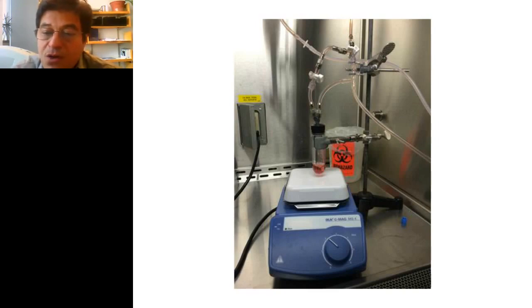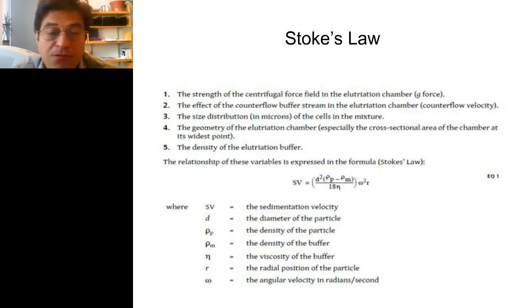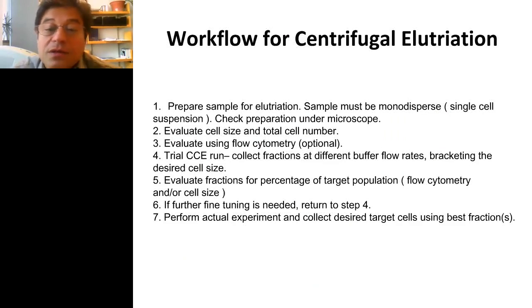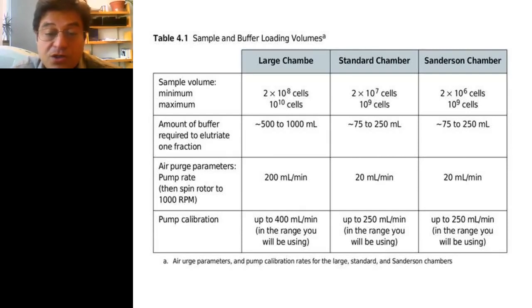The information in the manual for the existing chambers will illustrate what the ranges are. I'm not getting to it quickly. No, it's not it. Sorry. Okay, here it is. What the ranges are for these current chambers. There's a lot of latitude, but you're not seeing numbers like 10 to the fifth on there because you start losing material when you go on to the small side.